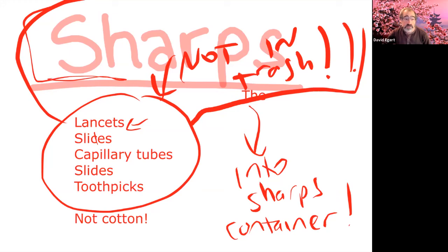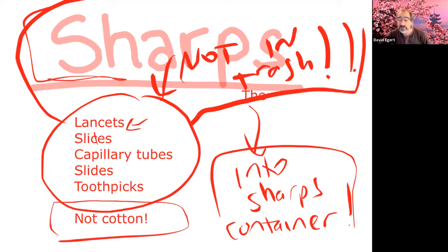So you always need to keep track of where your sharps are and make sure they're properly disposed of in the appropriate sharps container when you're doing blood work of any kind. As opposed to squishy things, where in the classroom we usually have bags that get autoclaved, basically sterilized, not these special containers for sharps. With squishy stuff, the lab tech or the custodian can grab it and shove it somewhere, and there's no worry about a needle poking through and jabbing them.